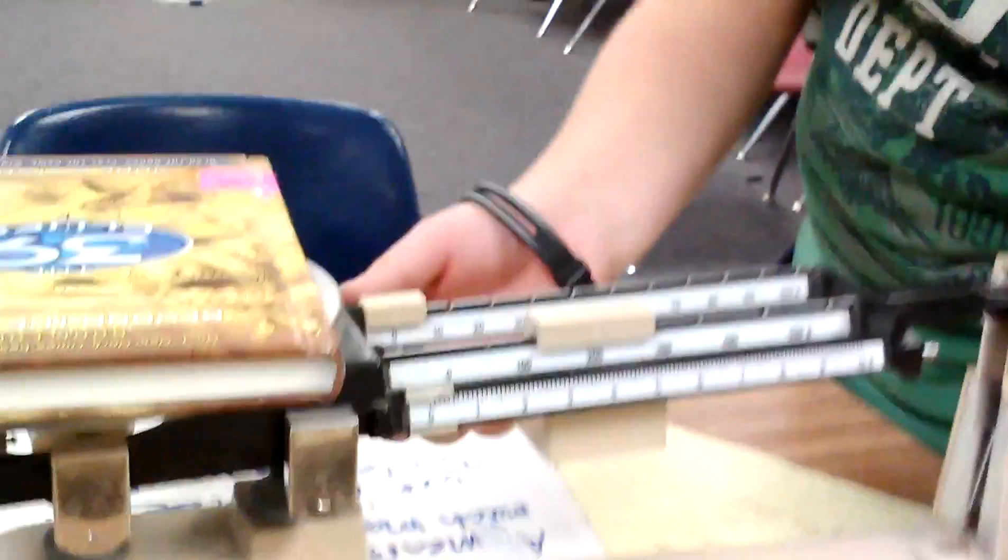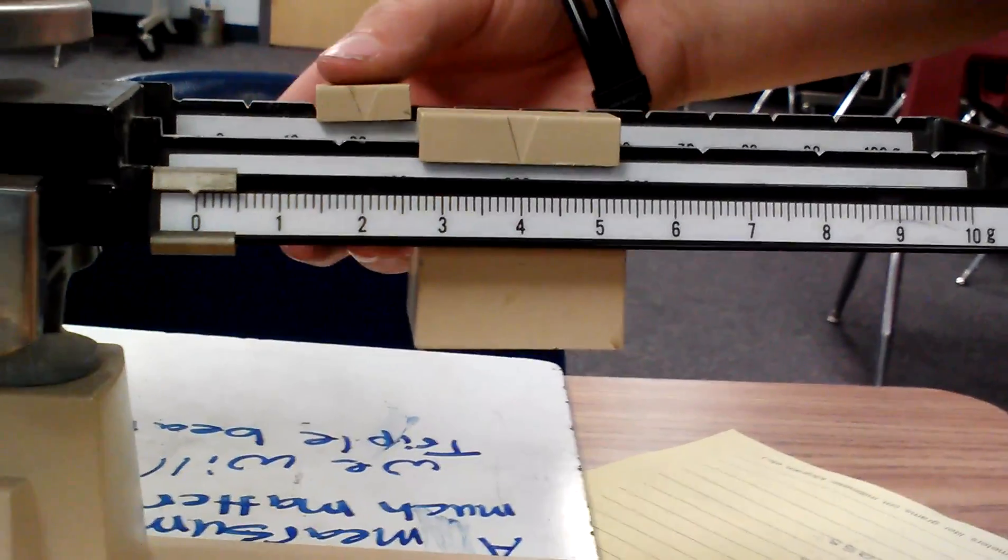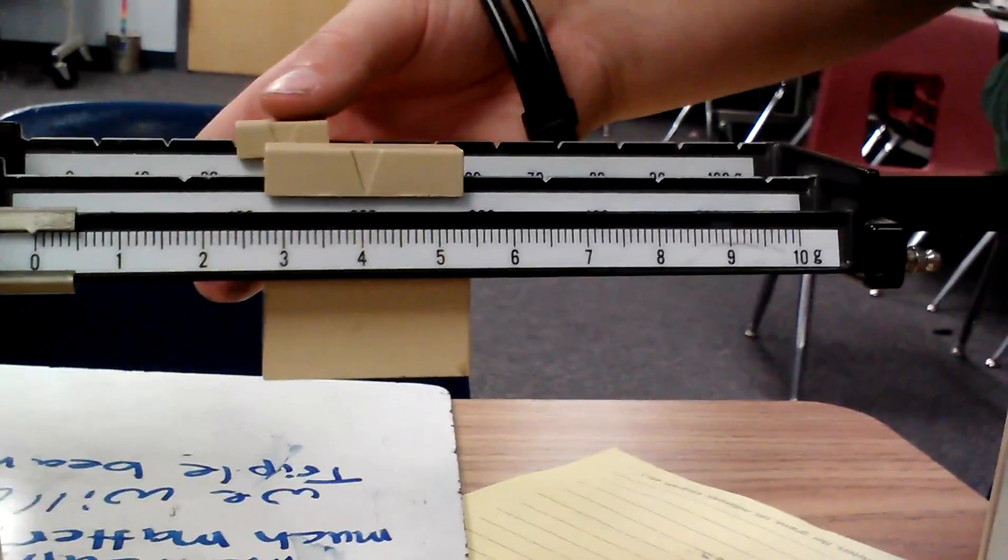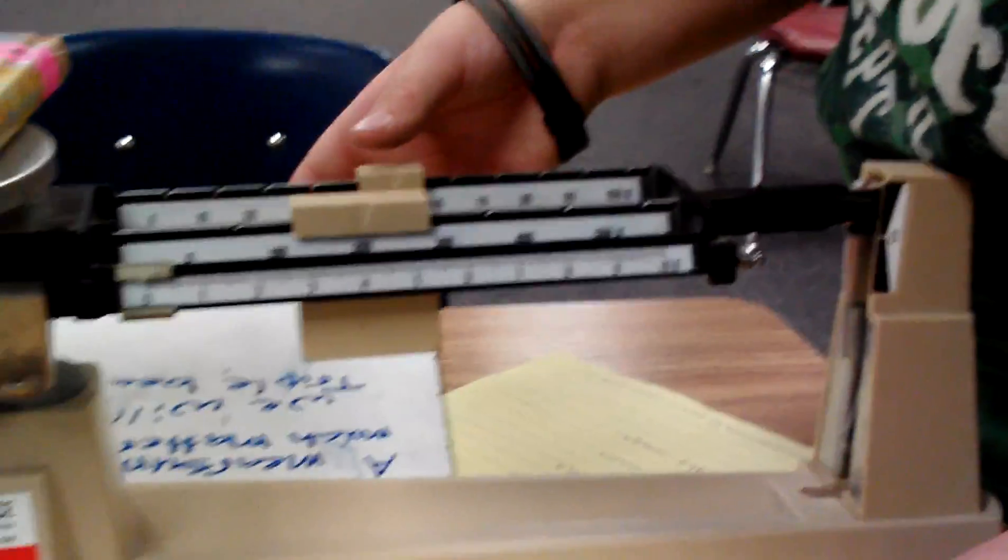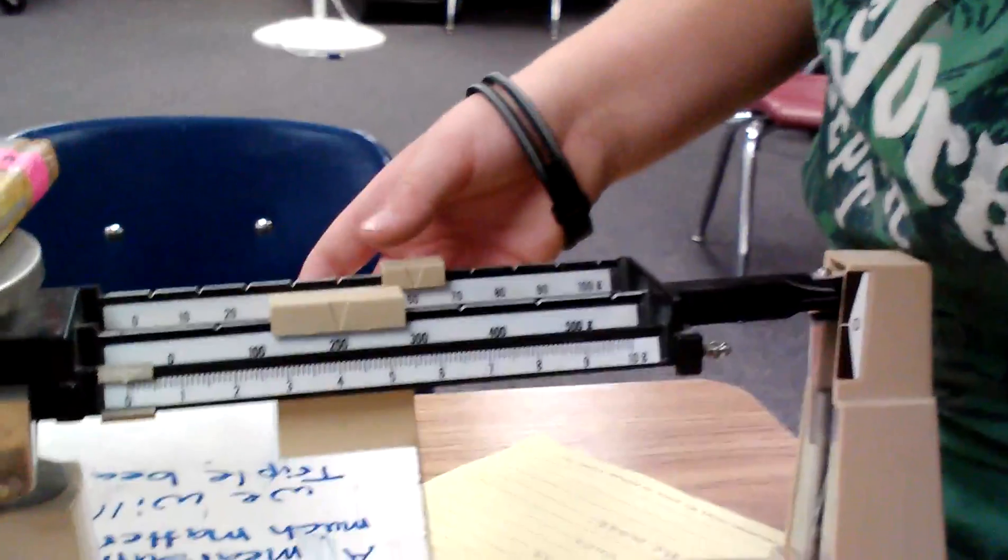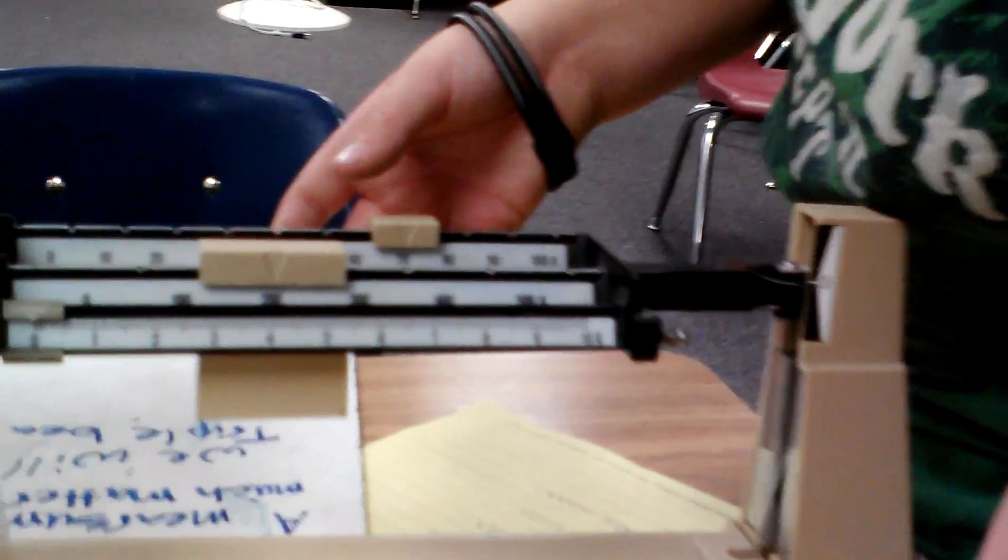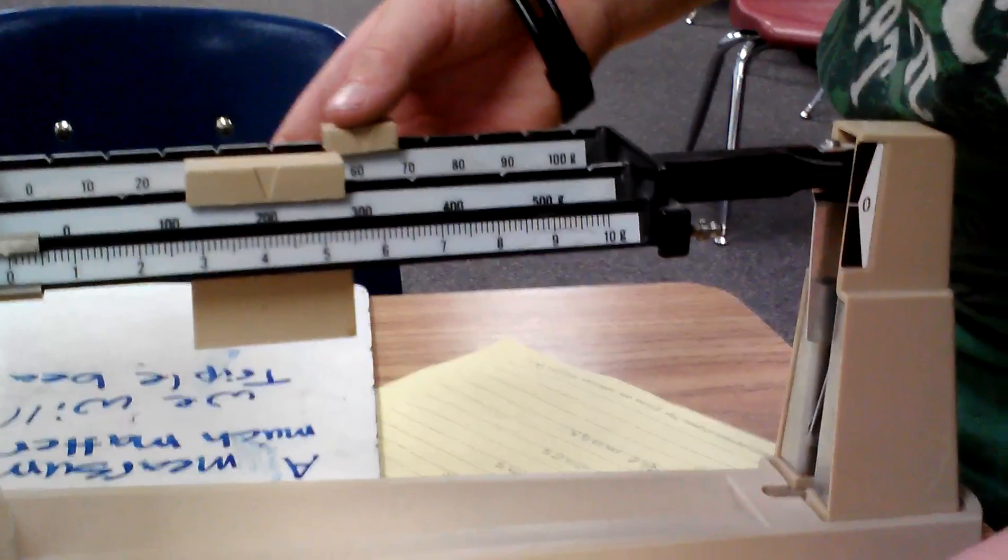And I'm going to move the tens. There's a ten. 20. 30. 40. 50. 60. 70. 70 is too much, so I'm going to go back to 60.